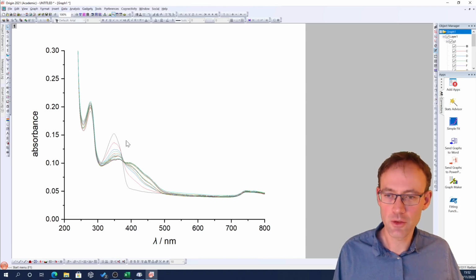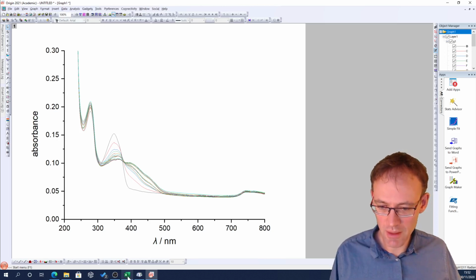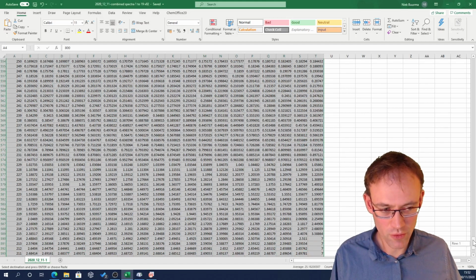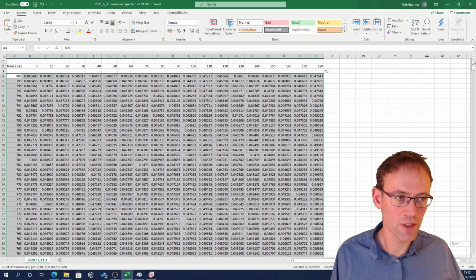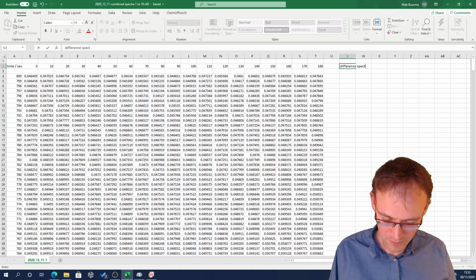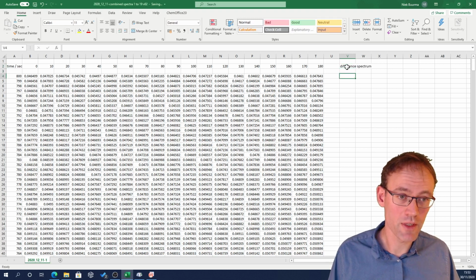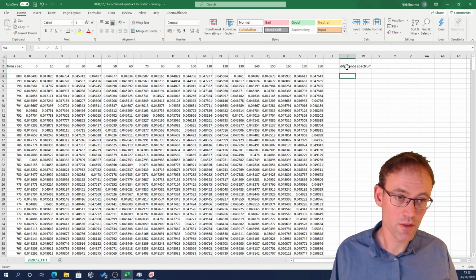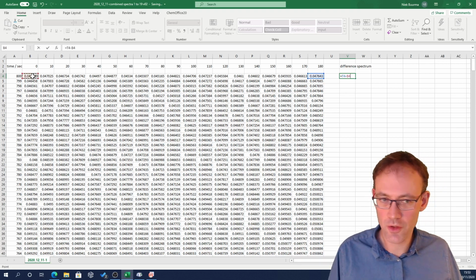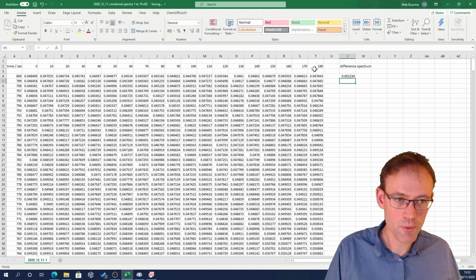So in order to find out where I have the biggest changes, I am going to go back to Excel, and I am going to calculate something that is called a difference spectrum. A difference spectrum is simply the last recorded spectrum minus your first recorded spectrum over here.